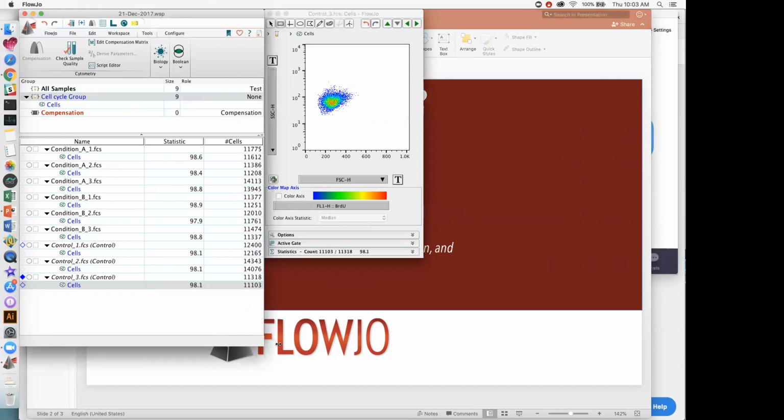I should mention that in most of the cell cycle type of experiments, we're staining our samples with a DNA intercalating dye like DAPI or Hoechst. Also, propidium iodide and things of that nature are fairly common. It seems like every year there's a new DNA binding dye or new dyes for different applications. Just keep in mind, you want something that you can use with cells that are either fixed or fresh, and you have to pick the correct dye for the appropriate application. And of course, just be wary of the spillover of the dye, especially if you're attempting to use multiple colors for a cell cycle experiment.